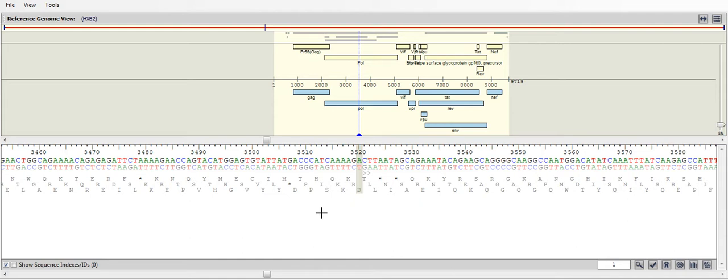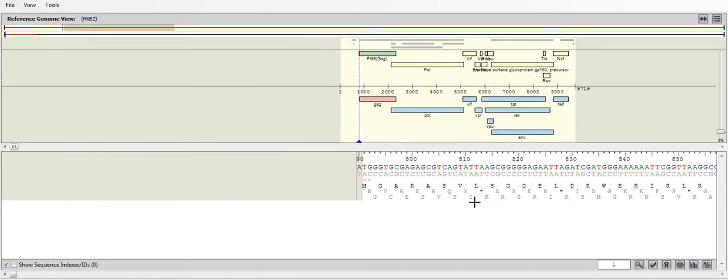A single mouse click on either gene or feature focus highlights the feature in pink. A double click selects the feature and colours it in green with the sequence shown below. Another blue bar now appears at the top, which represents the feature selected, with the red indicating the region of coverage of the reference sequence showing.